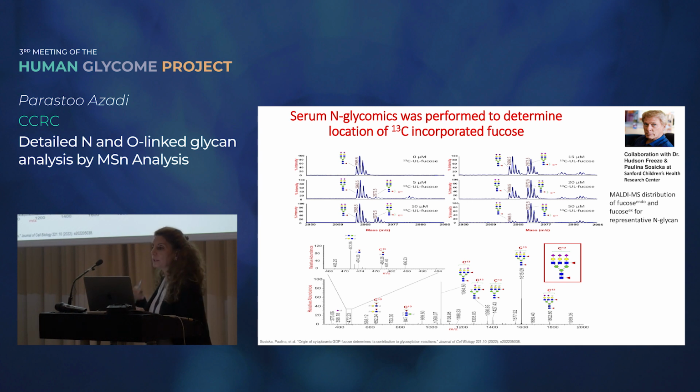You can look at more details. It's an extensive study. They did a lot of work. We just did a limited amount of work on figuring out exactly the location that the fucose is going to.